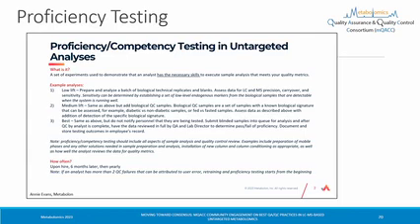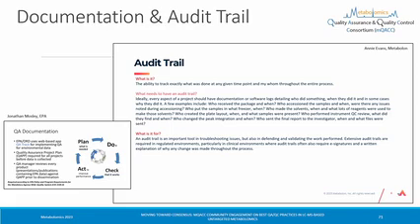As we get further up that pyramid, we get towards more difficult topics, proficiency testing. So this is from Annie Evans at Metabolon. In terms of exactly what they do and why they do it, the idea here is specifically to routinely make sure that you have a staff, it could be a staff across sites in a very large lab, who are behaving appropriately and competently in their ability to make measurements. Again, this is perhaps more intrinsic in smaller labs, but as it becomes larger organizations with more liability, it has to become more explicit, right? And that's what Annie's talking about here.